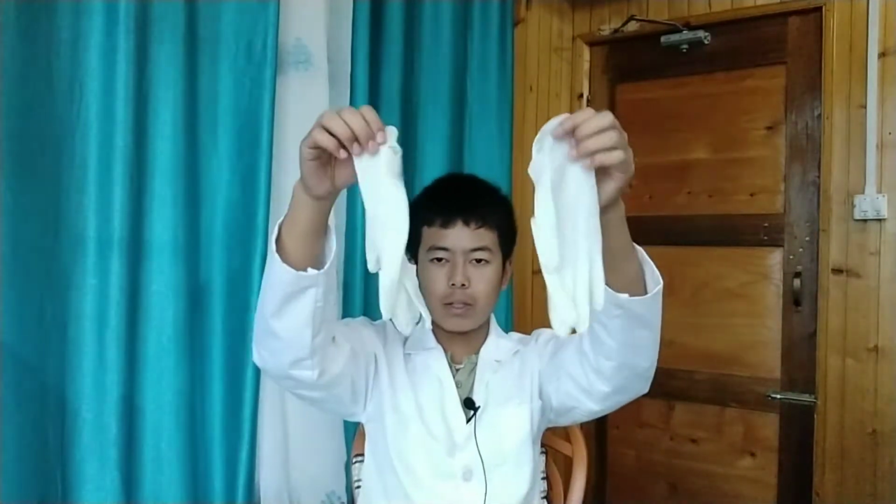And I also use surgical gloves. These have only one-time use, so you should keep a pack. I also keep a pack of these surgical gloves.